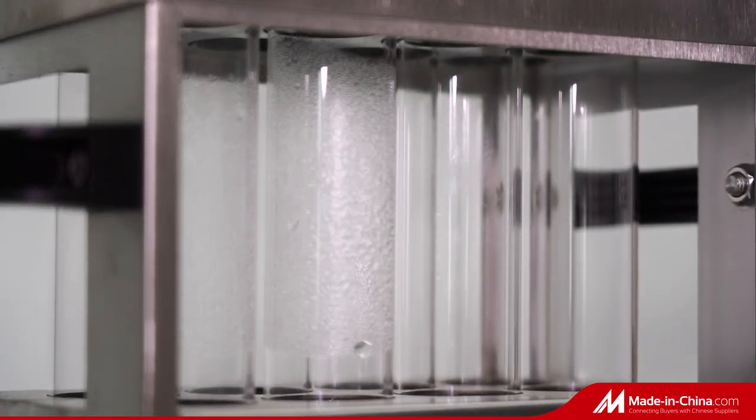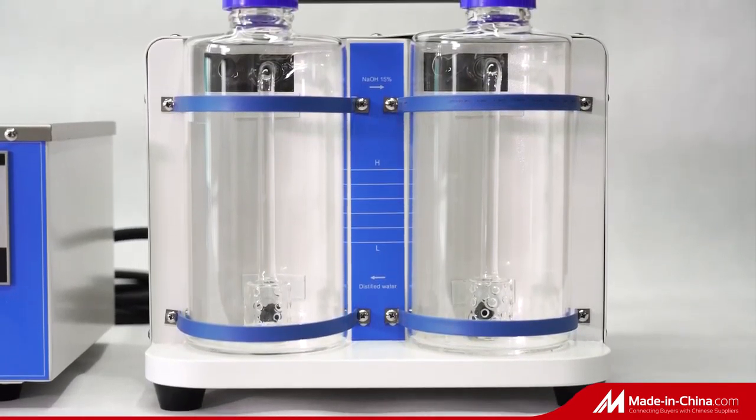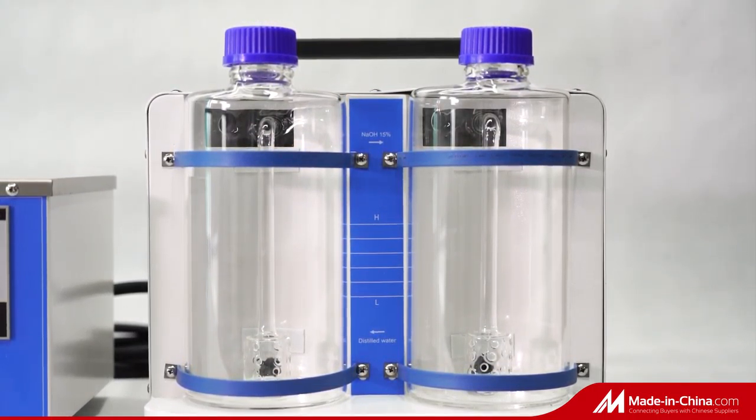Covered waste gas collector for acid mist collection. Acid-alkaline neutralization unit, used to absorb the collected acid mist, neutralize, and filter to achieve pollution-free emissions.